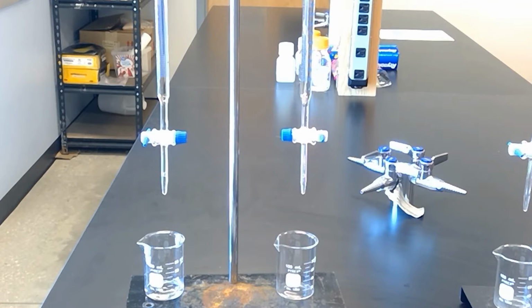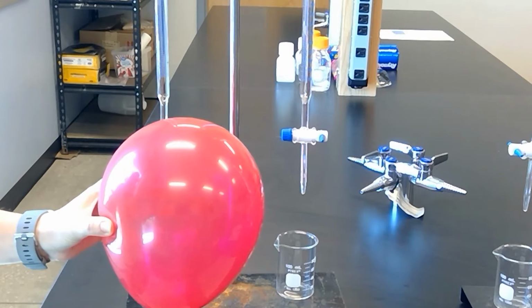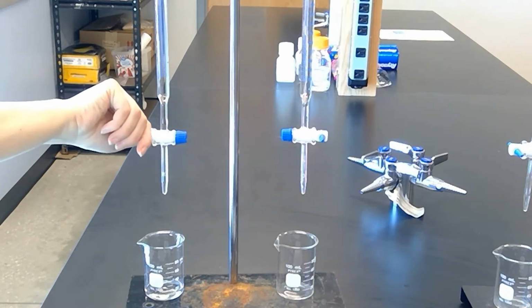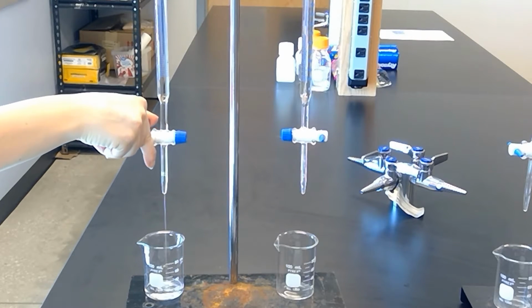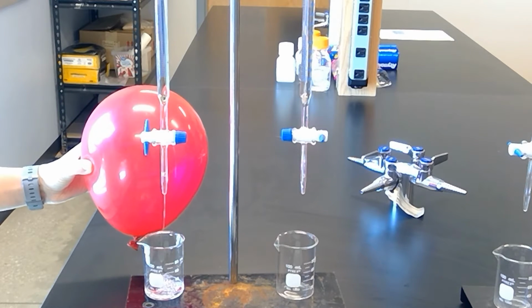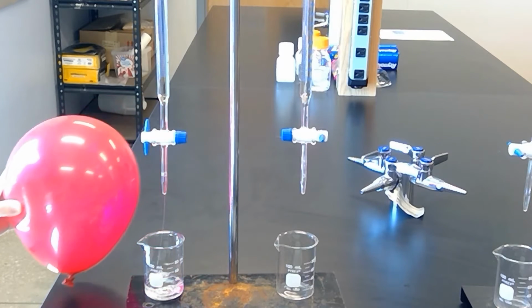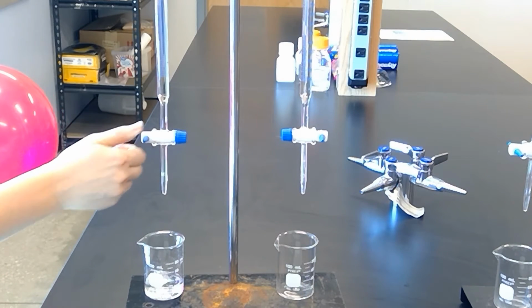a charged balloon. So I've taken a standard balloon, charged it by rubbing it up against my head, to provide some electrons. I'm going to open the burette and let the first burette, which is water, start to come out. And you can see it's a normal straight stream of water. As soon as I bring the balloon close, the water stream starts to bend a bit. I can do it from this side as well. Go ahead and turn that off.